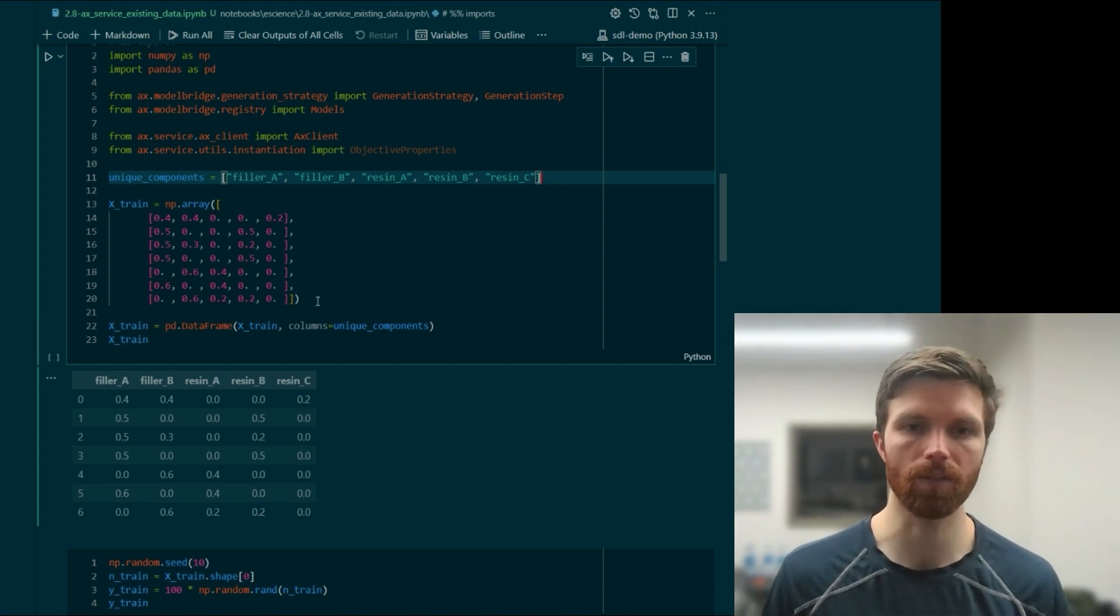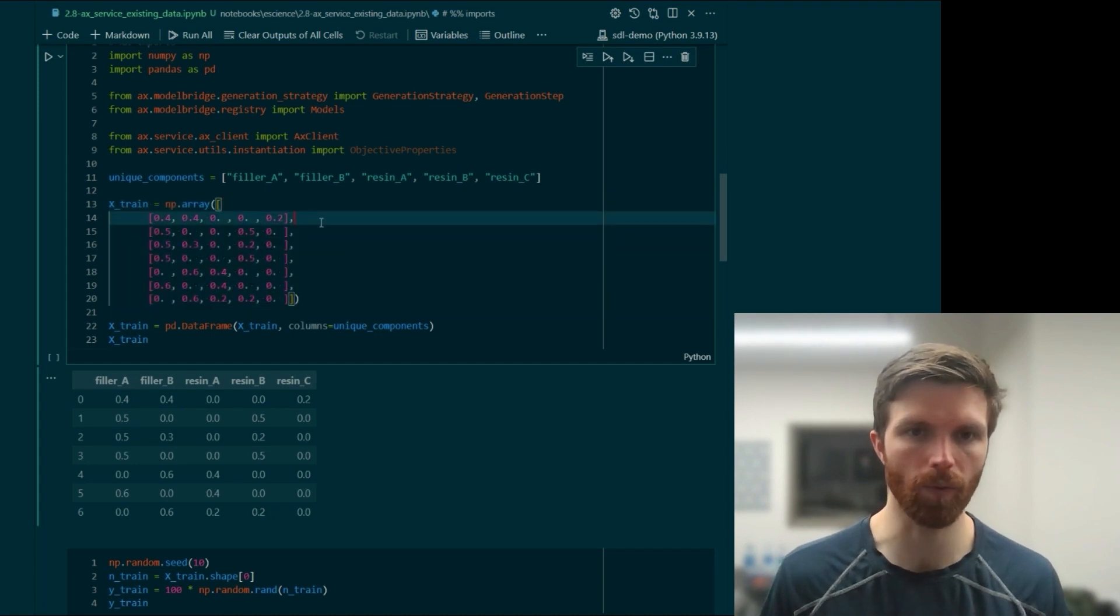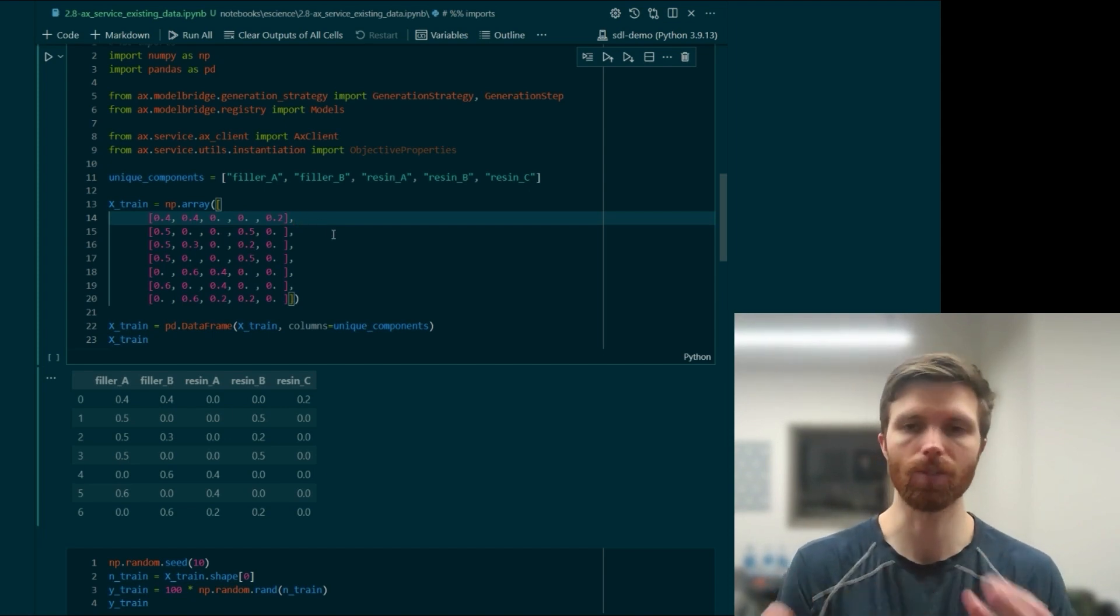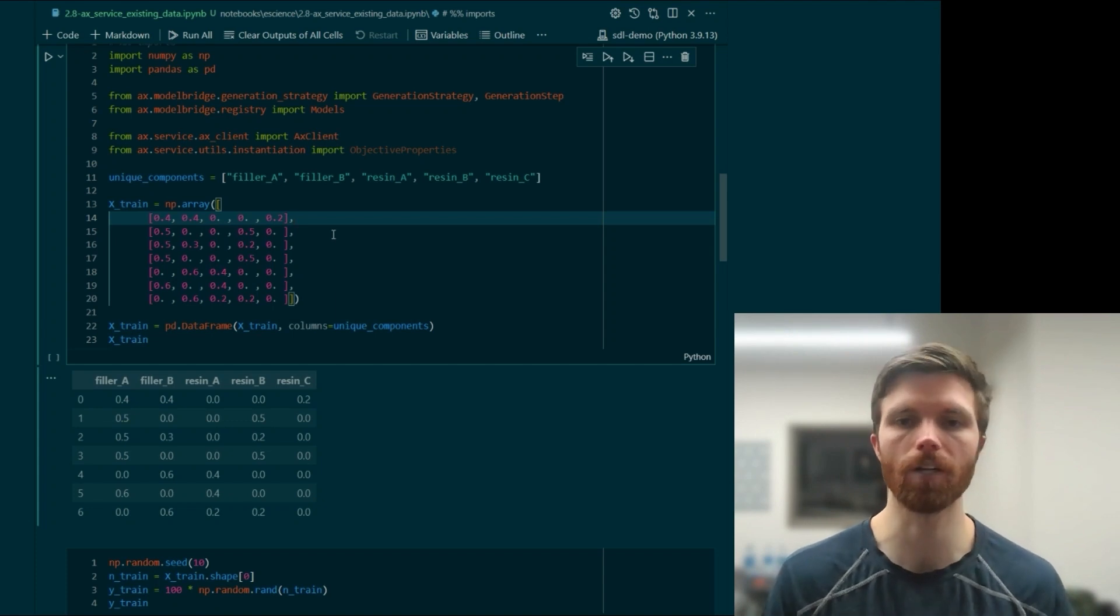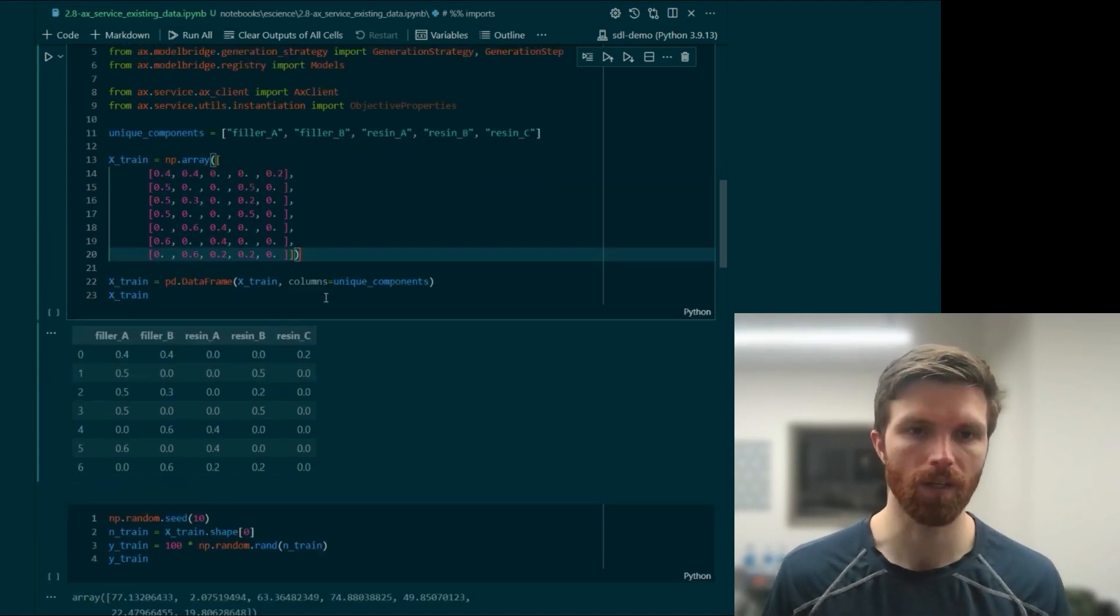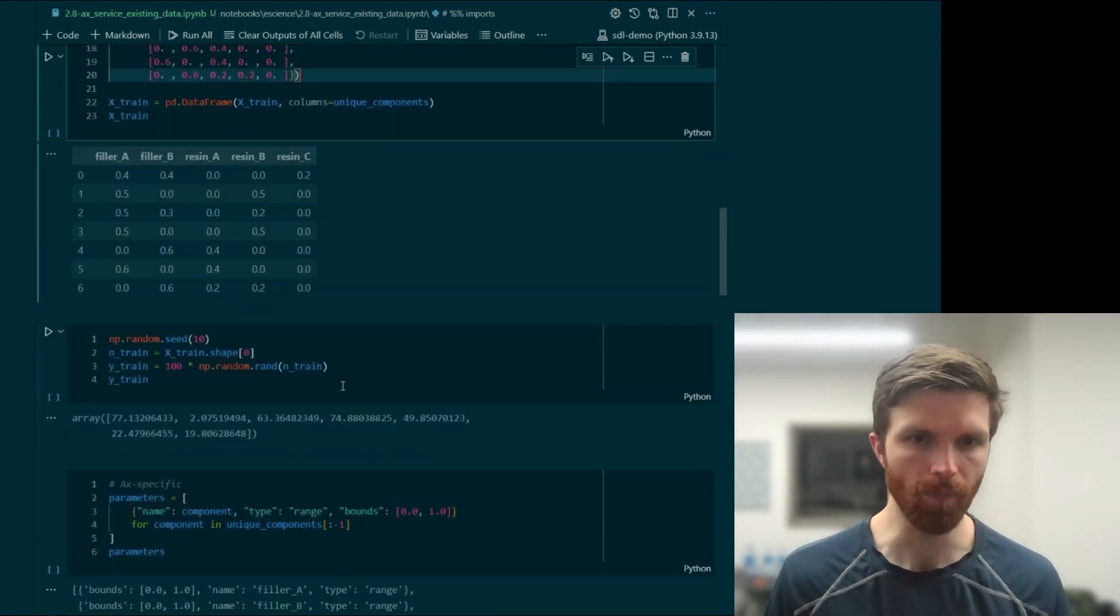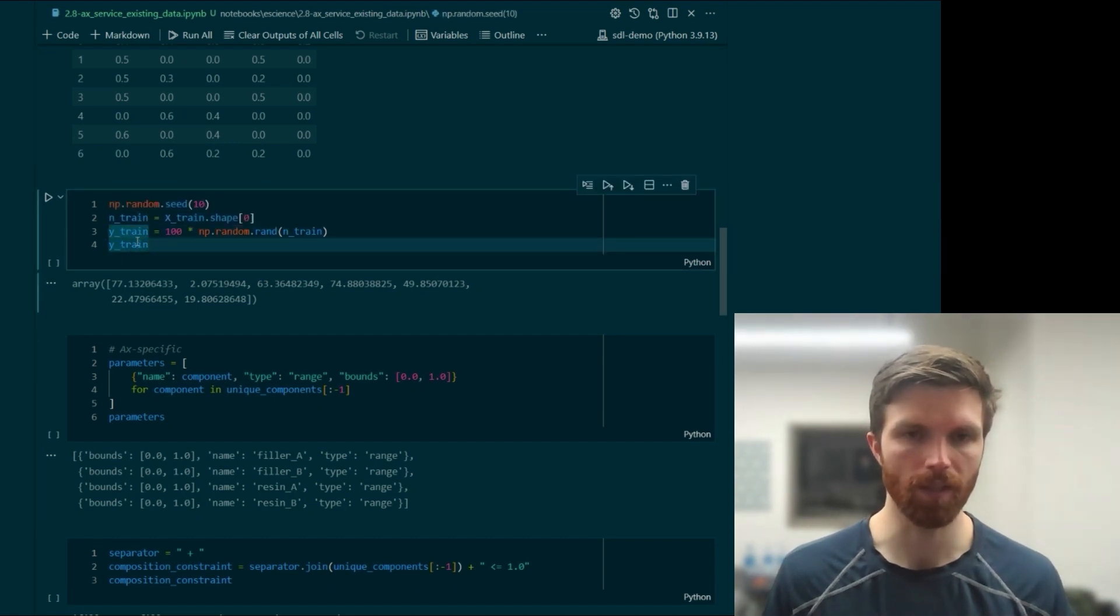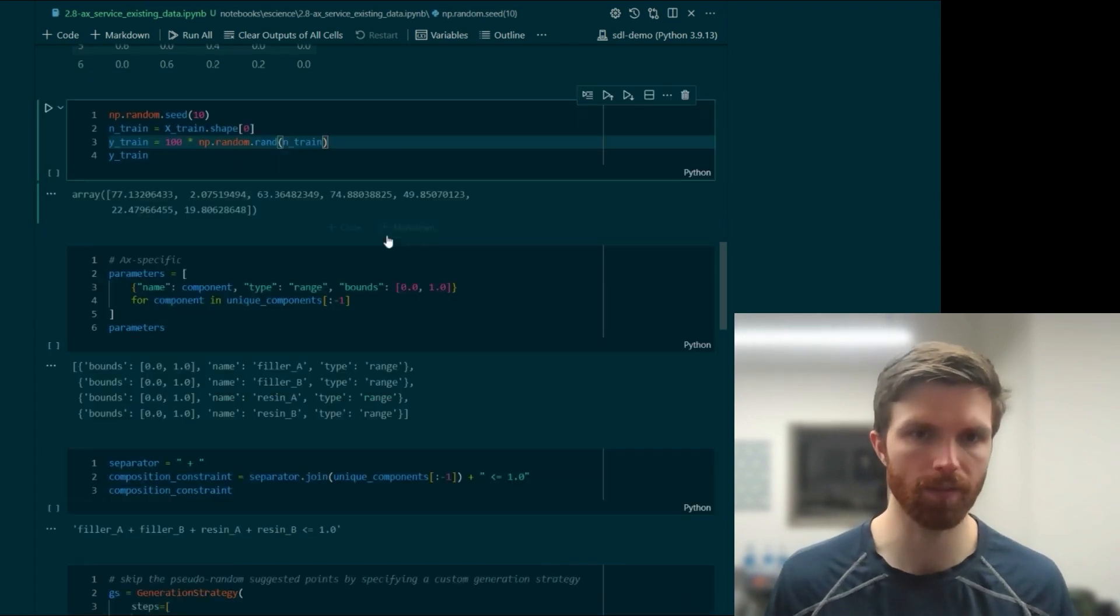We have some fake training data here where each of these rows sum to 1.0. In other words, it sums to unity, meaning 100% of the composition. So these are fractional values. We'll convert this to a data frame and then just create some random objective values to attach here.